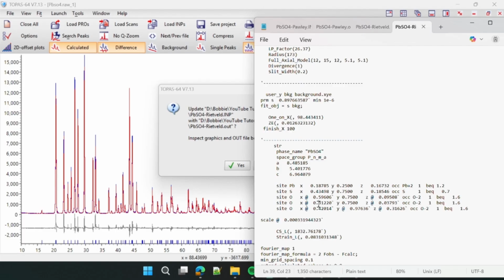V1, that's changed by a bit, so we'll just keep our eye on this one. 0.037, that's okay. 4-2, that's fine. 9-7, that's okay. 3-1, that's okay as well.